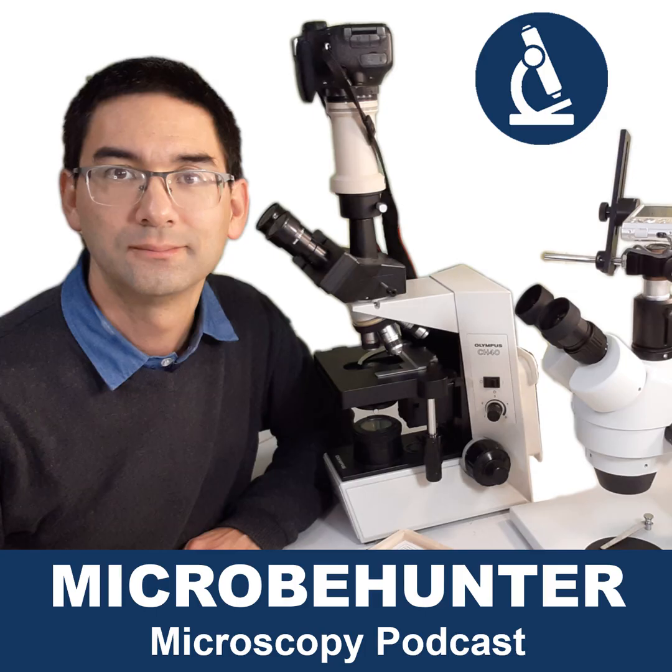Buy yourself a microscope if you're studying biotechnology, not because you need it, because chances are pretty good that you won't need it at home. But buy yourself one, because most likely you will not be using microscopes very much during your university studies. Okay, so this is basically the recommendation. And now I still know this does not answer your question, because you want to know, should you get yourself a phase or DIC microscope? And for those of you who do not know the difference, these are specialized microscopes which allow you to see very fine structures which are transparent.